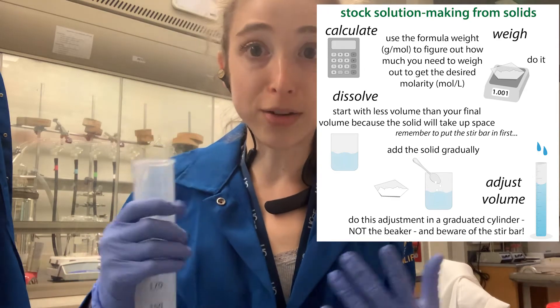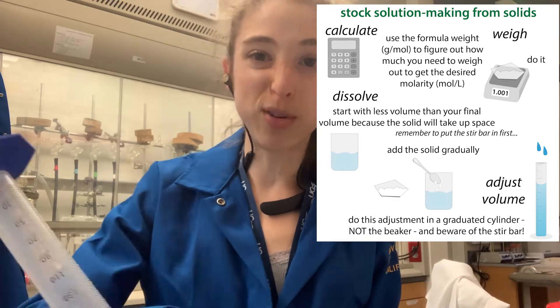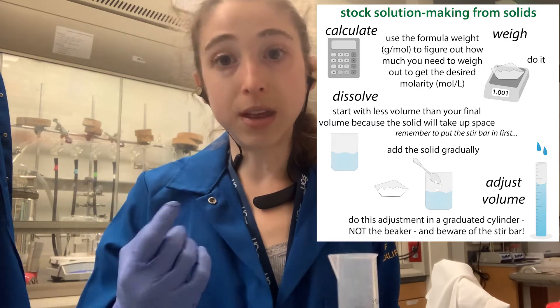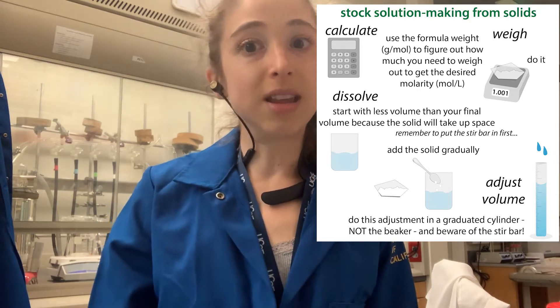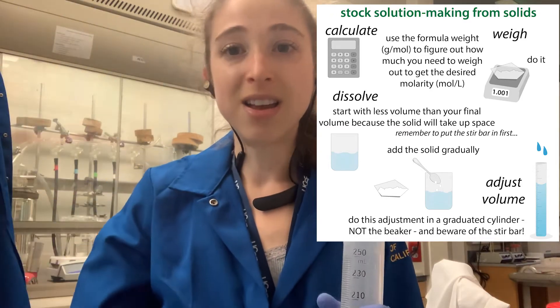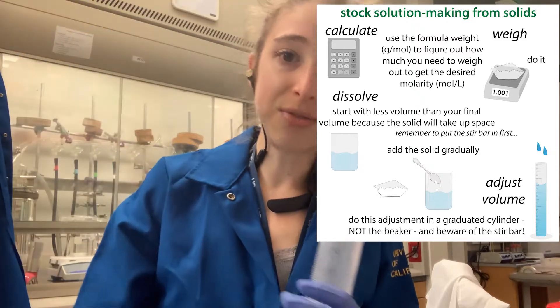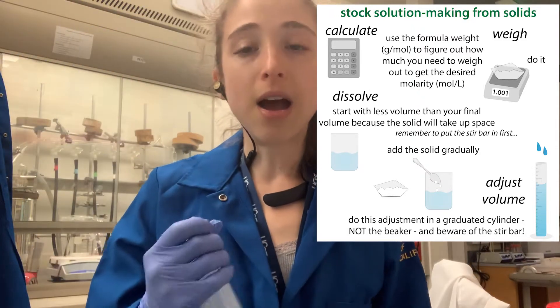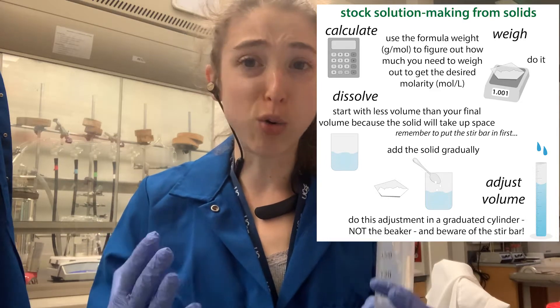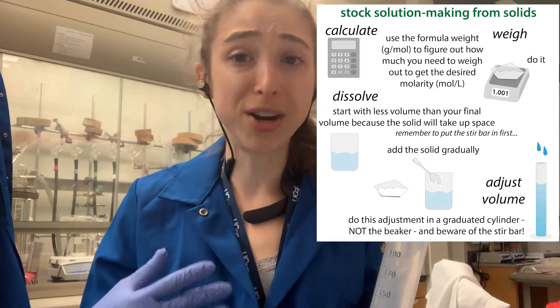So if you were to measure out the amount of liquid you needed beforehand and then pour it in and add your stuff, you're going to go above the volume you needed. There are ways to rescue it, but basically then you have to make extra volume and add more of your stuff. Instead, you want to add to about three quarters or so of the volume — it depends on what you're adding.